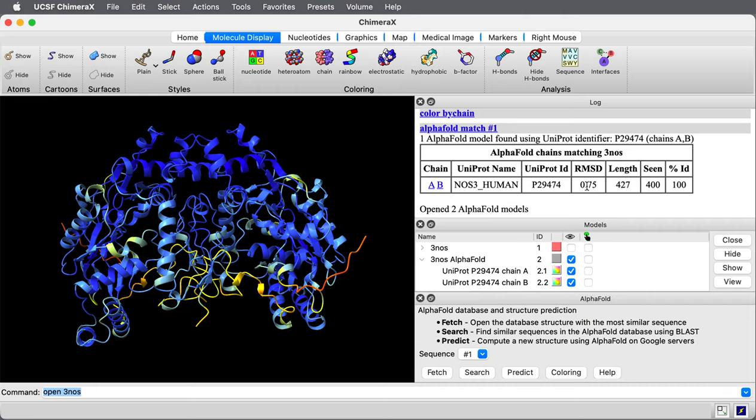It says the root mean squared deviation is 0.75. That's between this predicted structure and the experimental structure, C-alpha atoms only. Very, very close match.